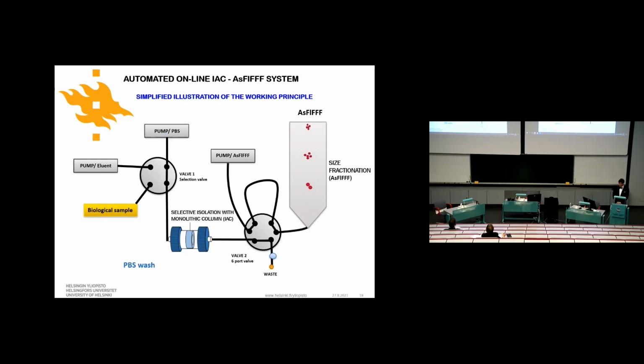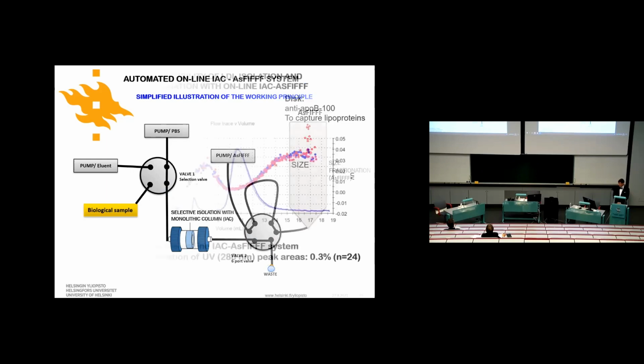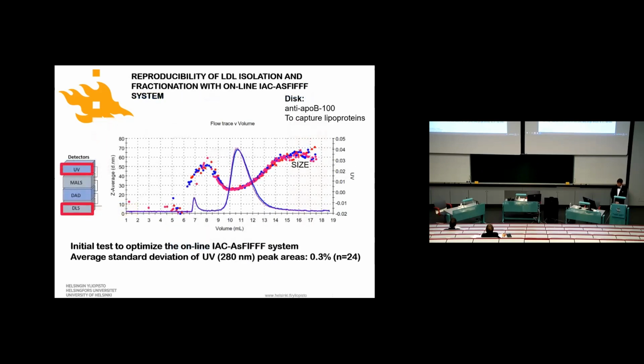And here we see the separation by size. First, the smallest particles arrive, due to FFF being in normal mode, and the bigger ones follow.